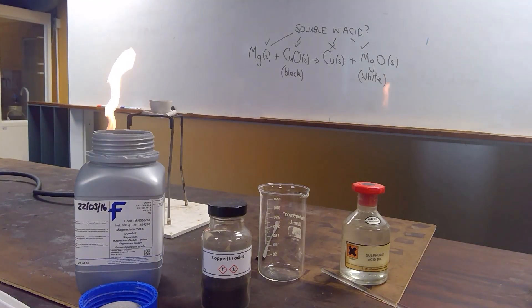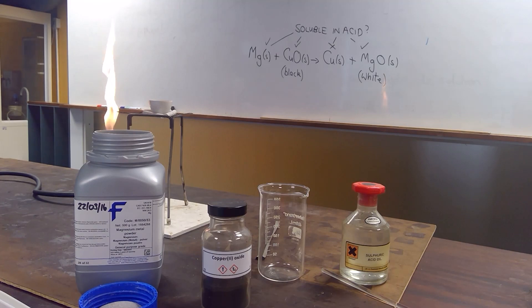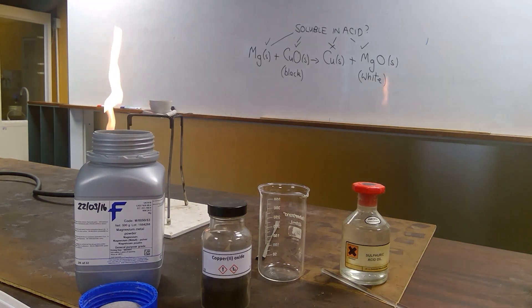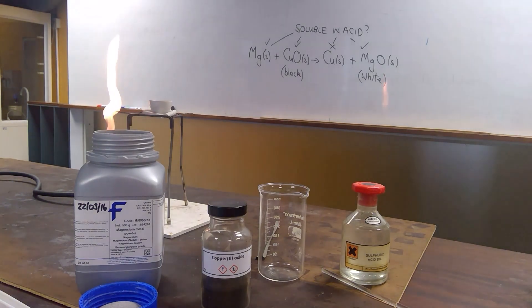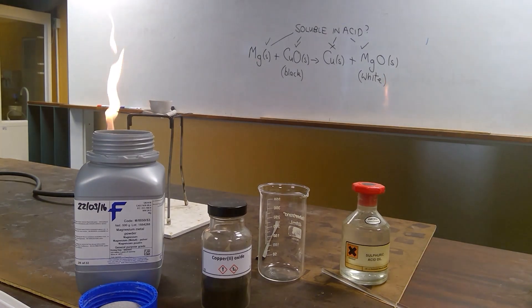This is a video to look at the reaction between magnesium and copper oxide. It is an example of a metal displacement reaction. It occurs between two solids, magnesium and copper oxide.